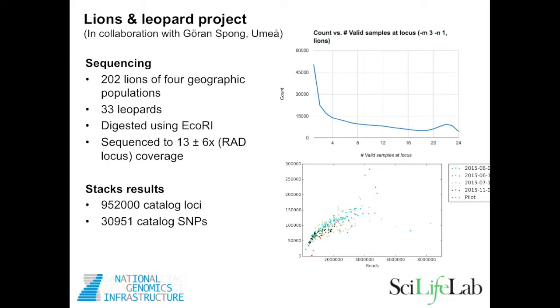I took out 24 lion samples and saw how many loci are shared between each sample. It shows that this data set is quite connected and doesn't only consist of singleton loci, which would be really bad, and you couldn't really tell much from it.